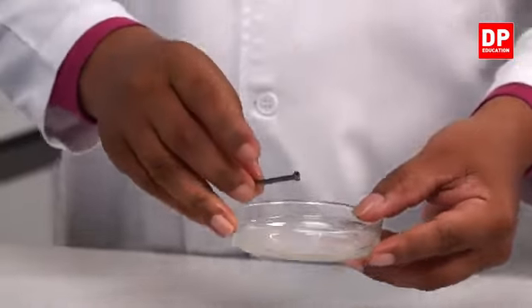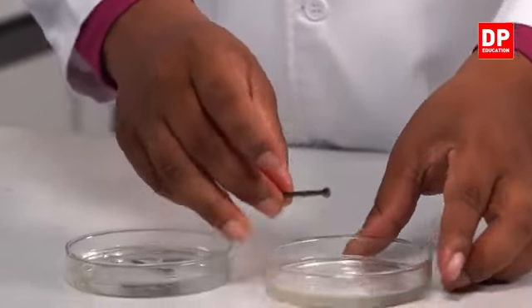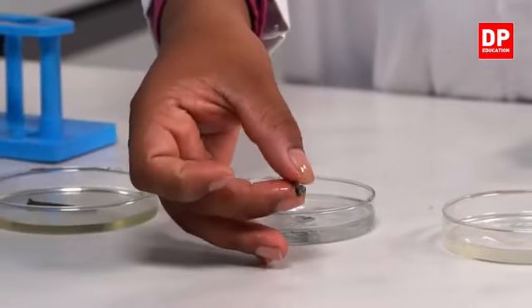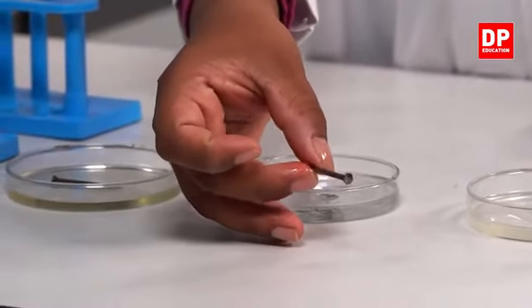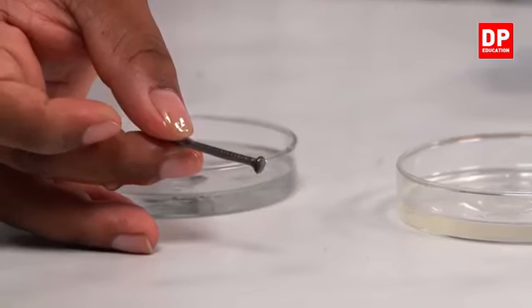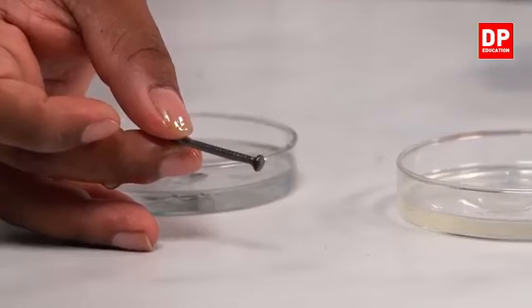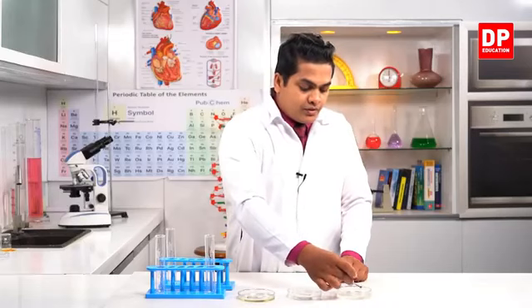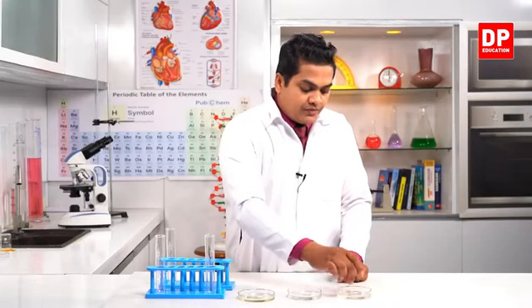So if you check this iron nail, you can see there is no rust at all. There is no rust at all, right? See, there is no rust. Right. So I'm going to keep it over here.